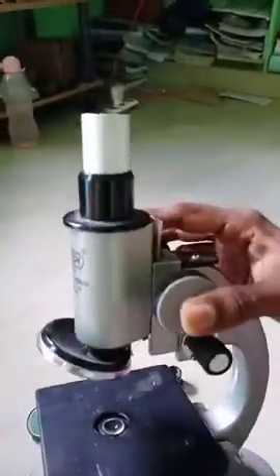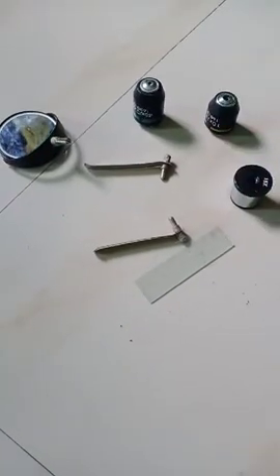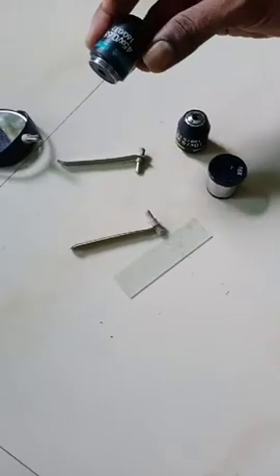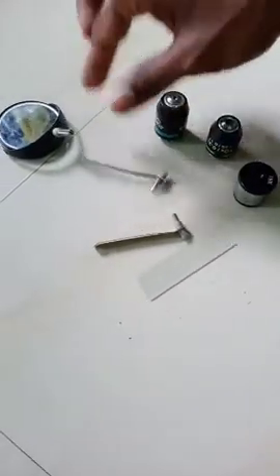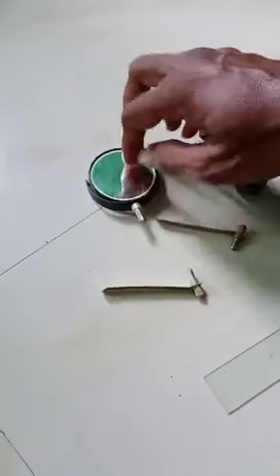So this is the brief information regarding the compound microscope. Here we can observe the dismantled parts: objective lenses, nose piece, 10x, 45x, clips, glass slide, lens.